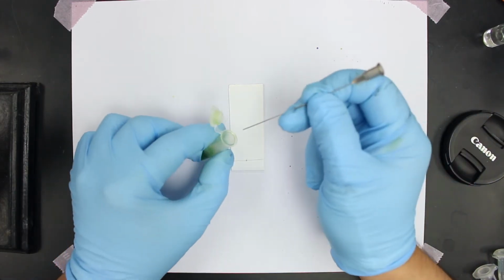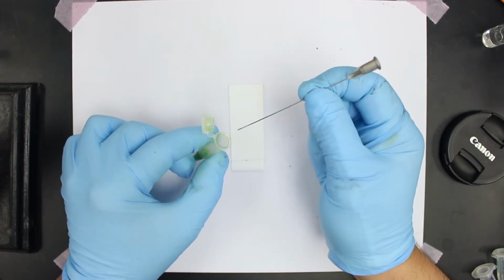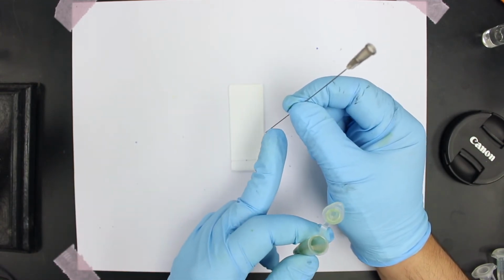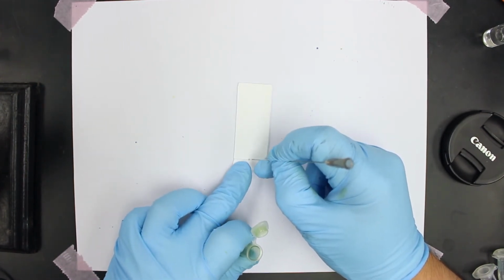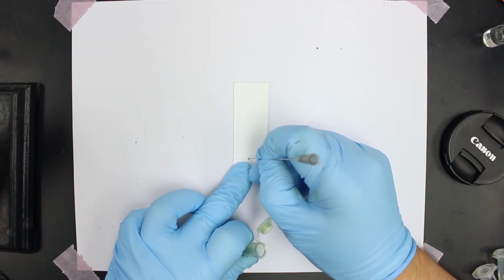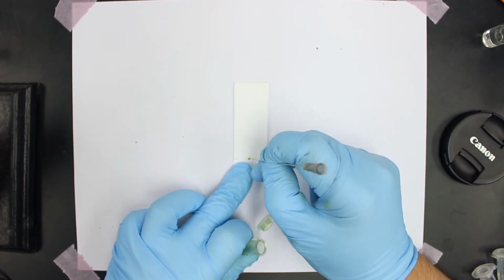So what we do is we take our capillary tube, or our spotter in this case, and we just dip it, and naturally, because of capillary action, the mixture will rise up into the tube. And this is the challenging part. It takes some getting used to, but you immobilize the plate and you very gently tap it. So tap. You can see that there's some liquid being deposited onto the origin.